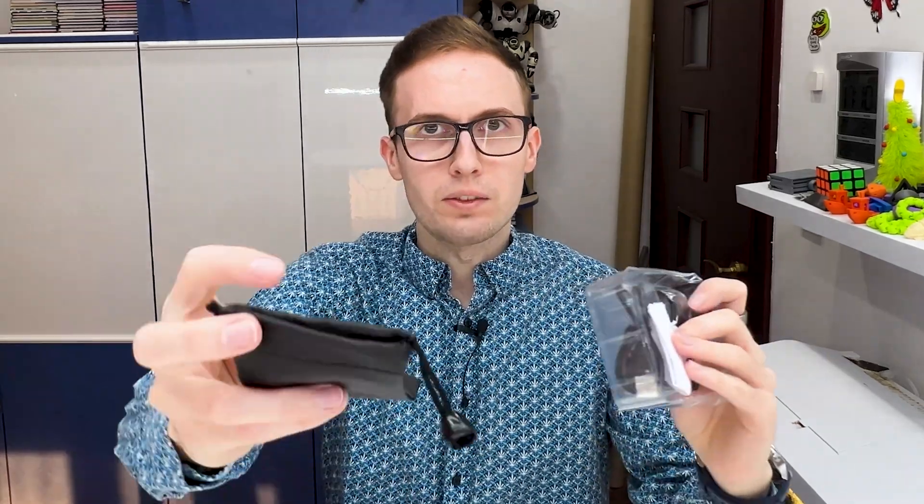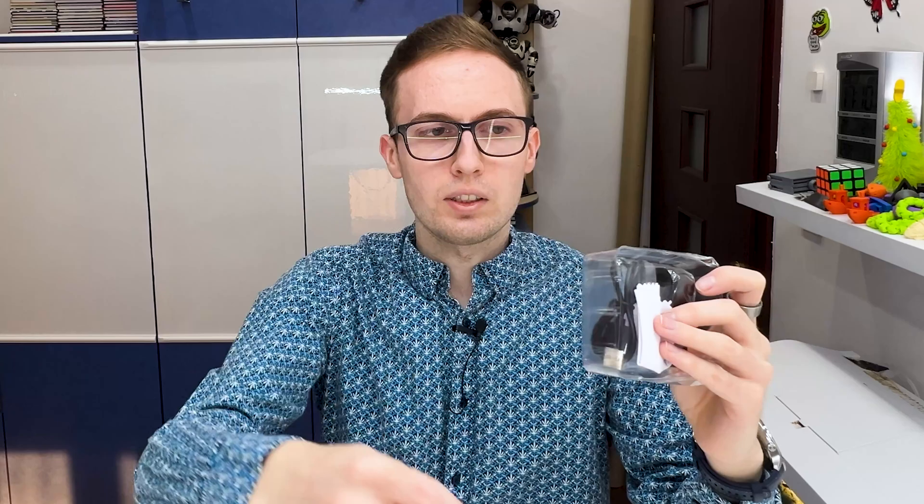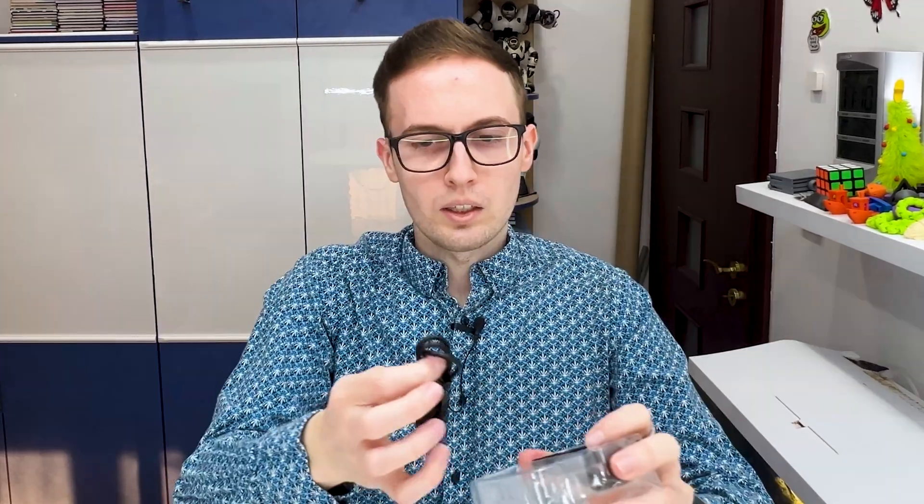I found this interesting smartphone microscope on AliExpress and it positively surprised me because of its image quality, and I'm going to show you how it looks like. In the package we have a manual, a small bag to store the microscope, a cleaning cloth, and a USB charging cable. The charging cable is for the light because the microscope doesn't use energy and doesn't need any application. Only for the light we need the built-in battery that you can charge using USB-C, and we have this microscope.